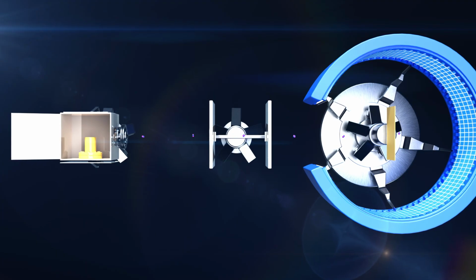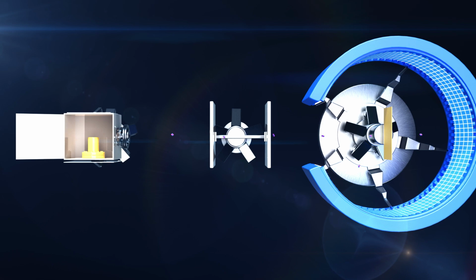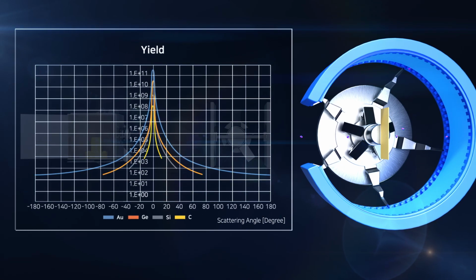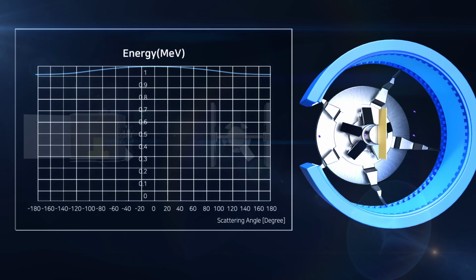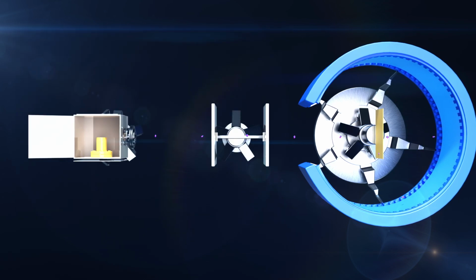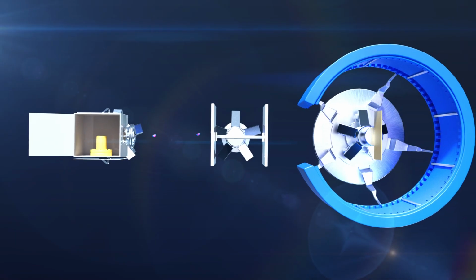According to Rutherford's experiment, alpha particles that scattered after collision have different energies and scattering yields depending on the material of the thin film and direction of scattering. Thin films can be analyzed using ion scattering spectroscopy. The greatest advantage of this method is its quantitative analysis. This is because scattered particles are always detected at the same energy and yield in a specific scattering direction when irradiating alpha particles of the same energy and amount.